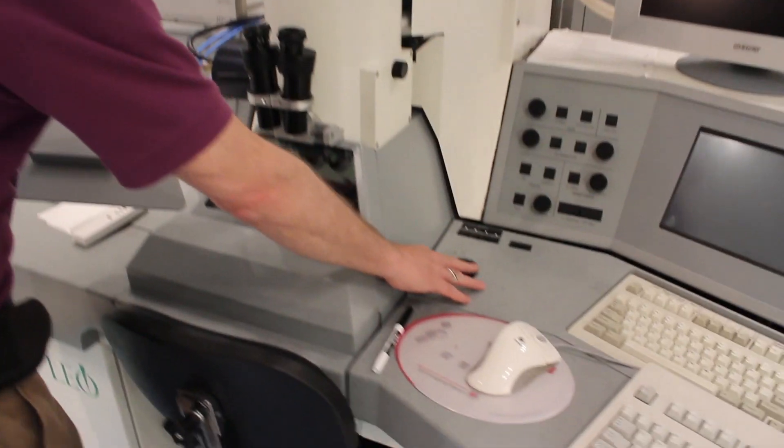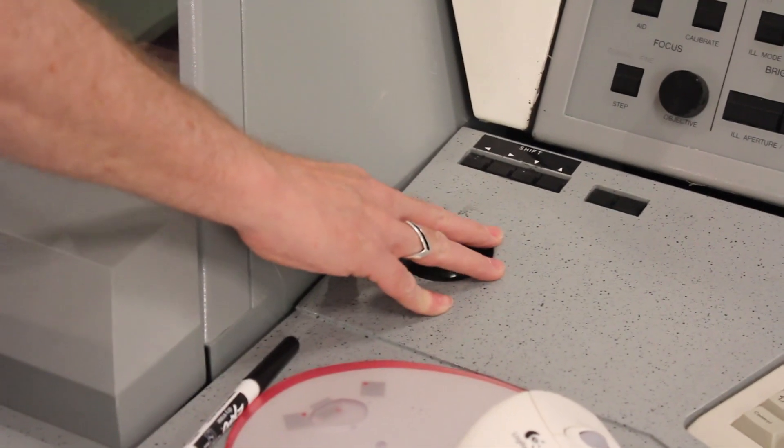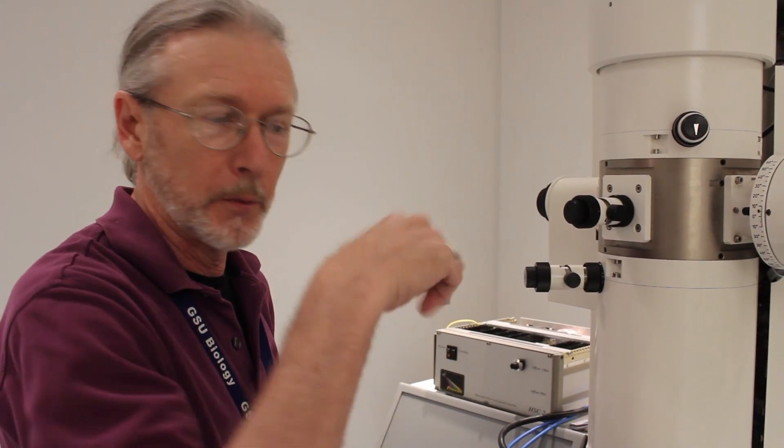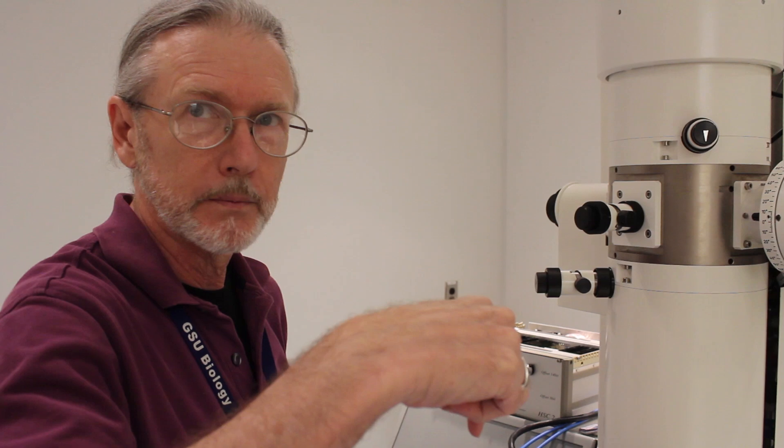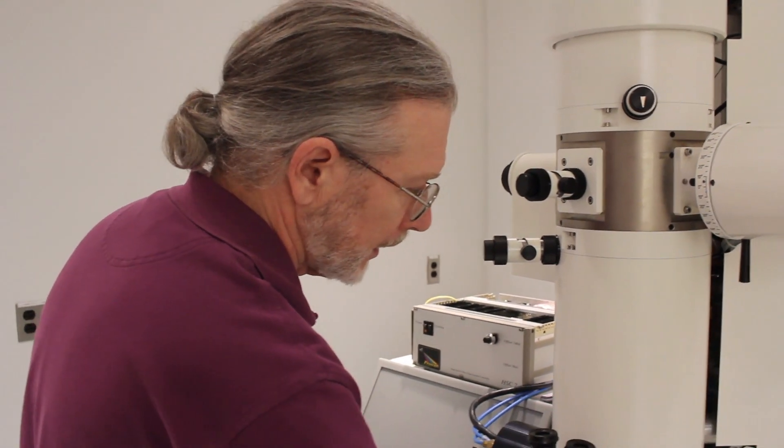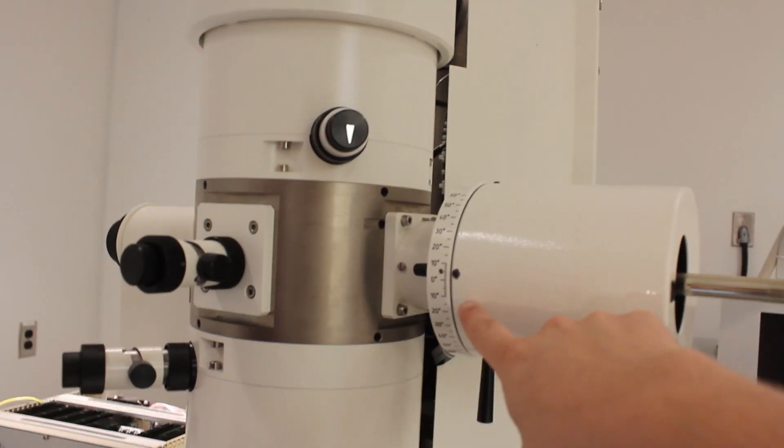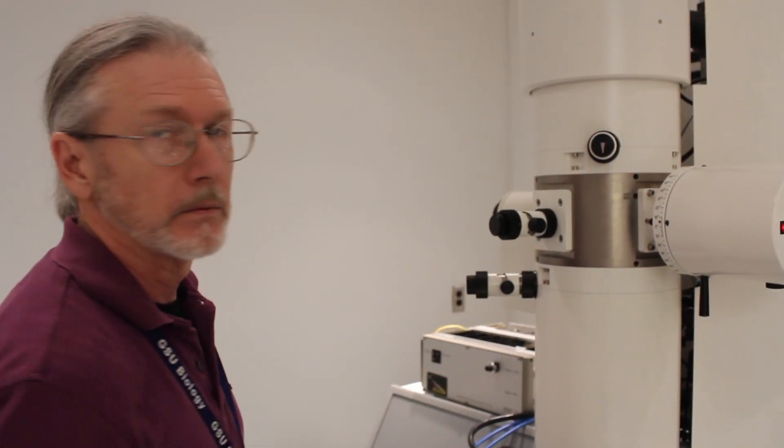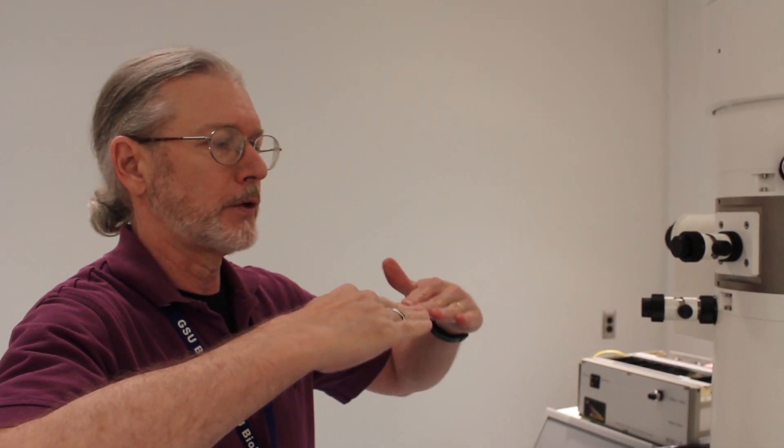You're going to look at different parts of your sample by moving that sample around. And with this microscope, we move everything from the trackball. The trackball is set up to stepper motors up here in the stage that are going to move that sample back and forth. The beam stays in the same place. It looks like you have a mechanical override here if something goes wrong. This is for tilting the stage. I can loosen this and then tilt the stage over. Sometimes if you're doing what's called tomography, what you want to do is take a picture and tilt, take another picture and tilt, and do a series, a tilt series like that. And then in an image processor, put them back together and it will give you a three-dimensional structure.